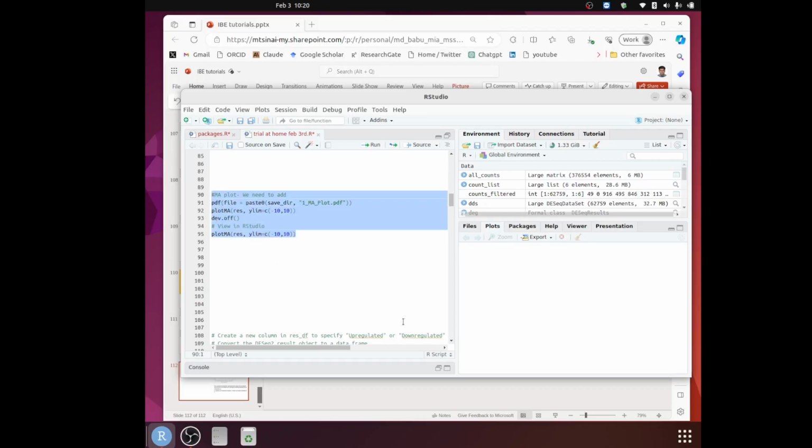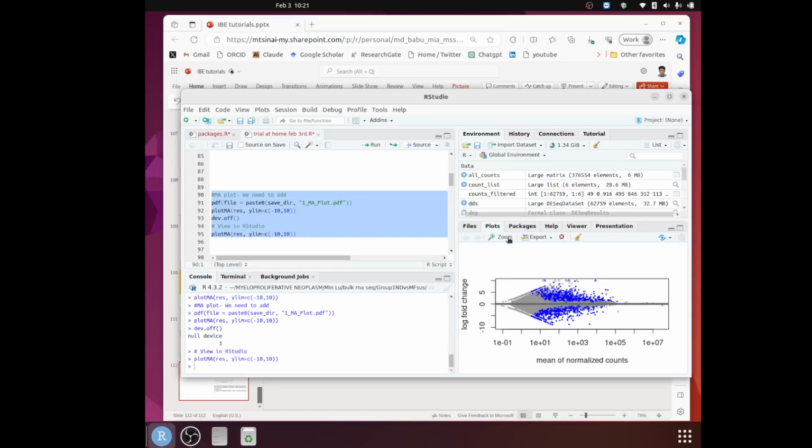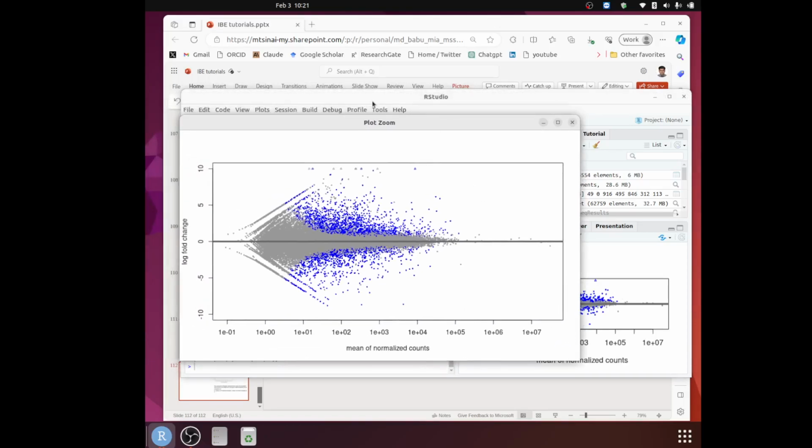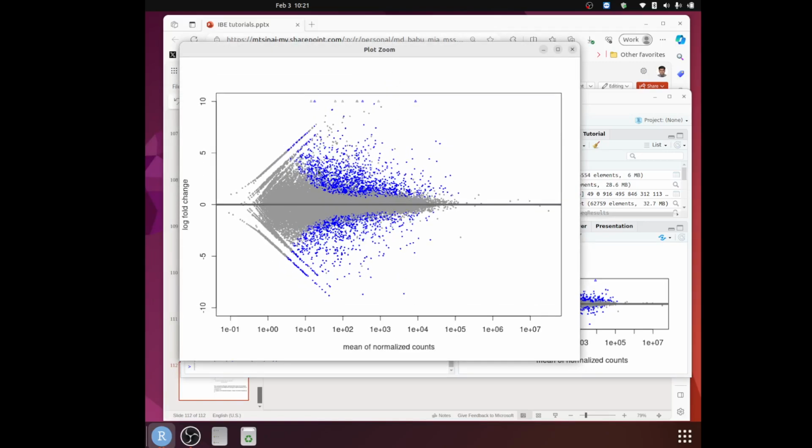So you write it like this, which is plotMA, and you go to the DESeq repository, the analysis, and you set the graph parameter. So if you run it like this, you'll get this. DESeq analysis interpreted the final MA plot. So let me explain this entire figure.